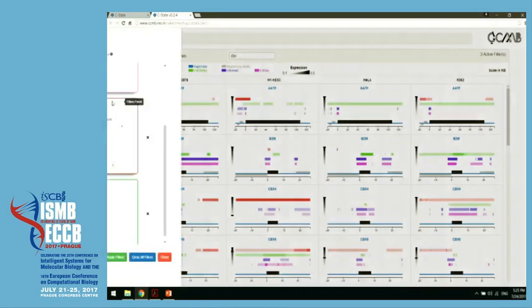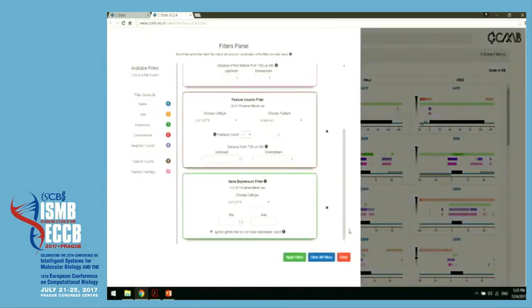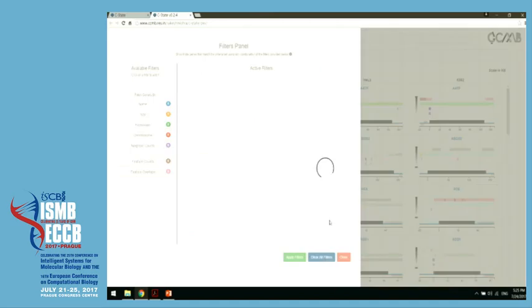So more filters are underway, but I guess this is what really helps. Particularly, people who are comfortable with bioinformatics can obviously get these answers very easily, but people, for example, in my lab, are not comfortable using command line tools. For them, I just load the data set onto this browser and give it to them, and they can play around with it without having to resort to programming or command line tools, right? So maybe I should have retained it.